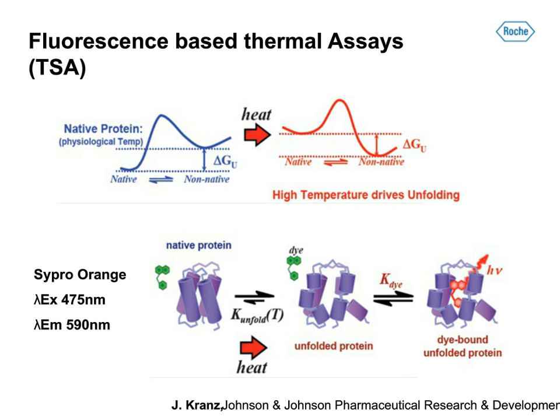And to do this process of actually picking up the fluorescence information, you need really good instrumentation to do that activity.